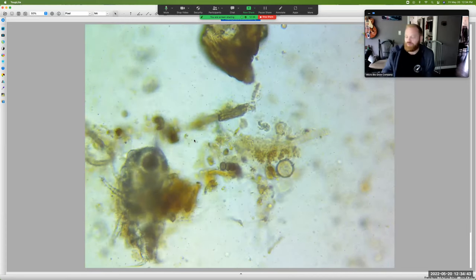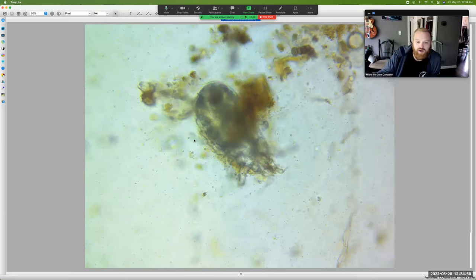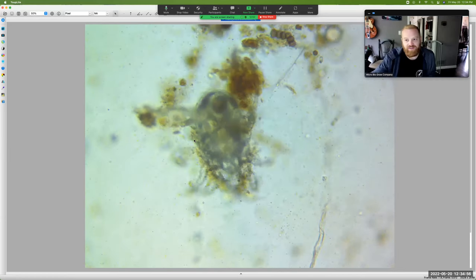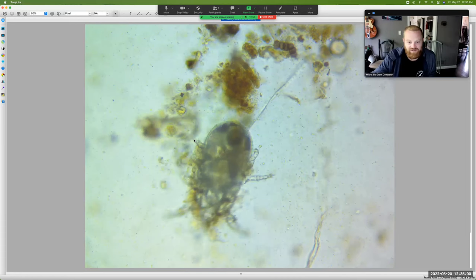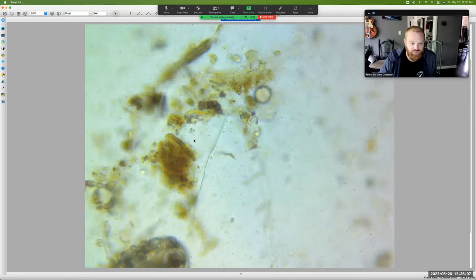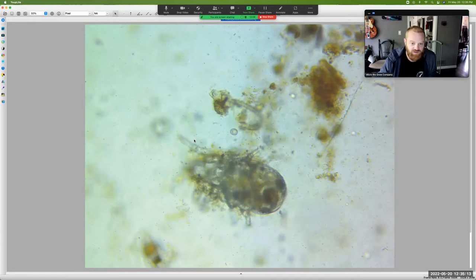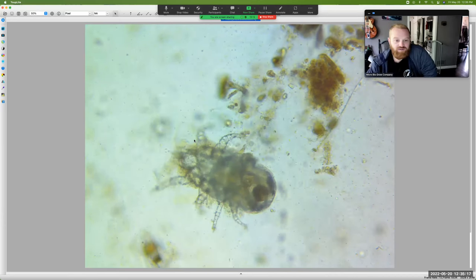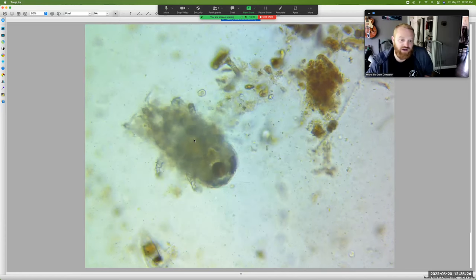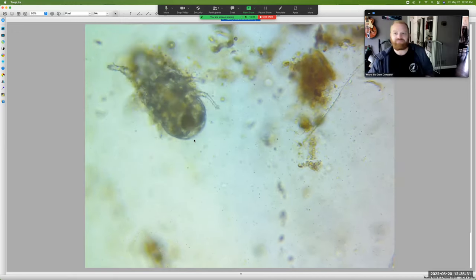Great stuff so far — we're just looking at all the macro stuff and we haven't even gotten to the smaller stuff. But those macro predators are definitely something to watch. Look at him go as he fumbles around and makes his way through the solution — really great shot. You can see so much of him and what's going on there, how he works. It just connects you to that soil.